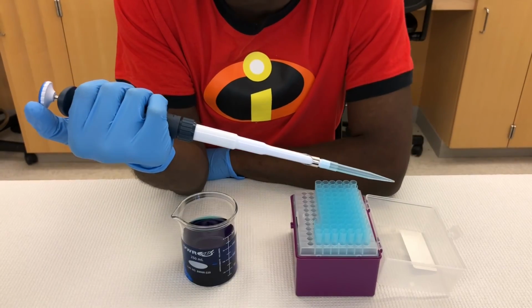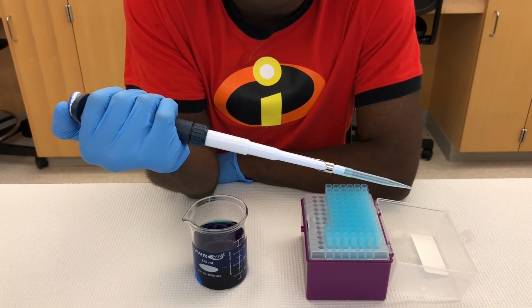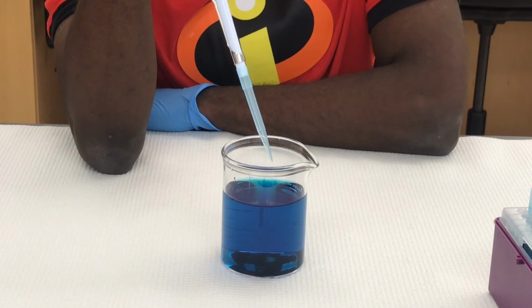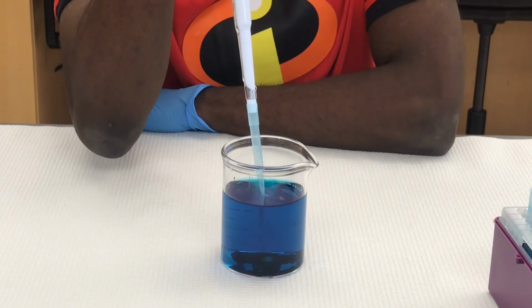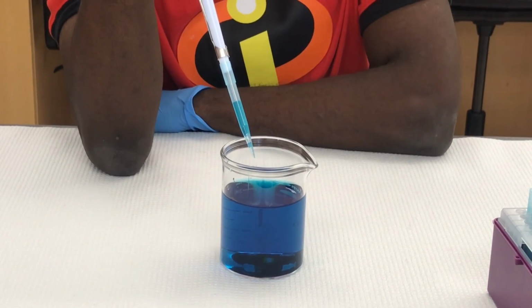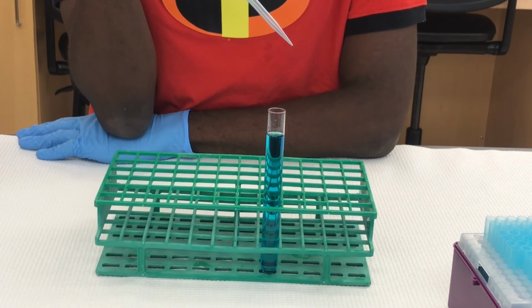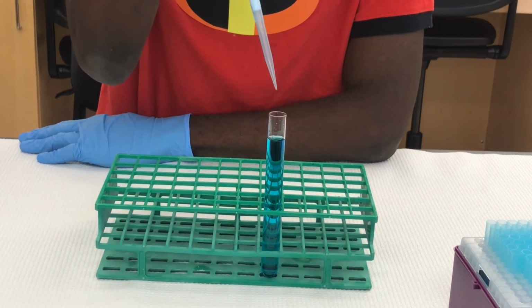When picking up a sample, remember you should only press the plunger to the first stop. Pressing beyond the first stop will cause you to take up a volume larger than intended. Always pause after releasing the plunger to allow the full volume of liquid to enter the tip. Removing the tip from the liquid too early can result in air entering the tip rather than the liquid. When pipetting from a narrow container, make sure your tip is at a proper depth in the sample so liquid rather than air is taken up into the tip.